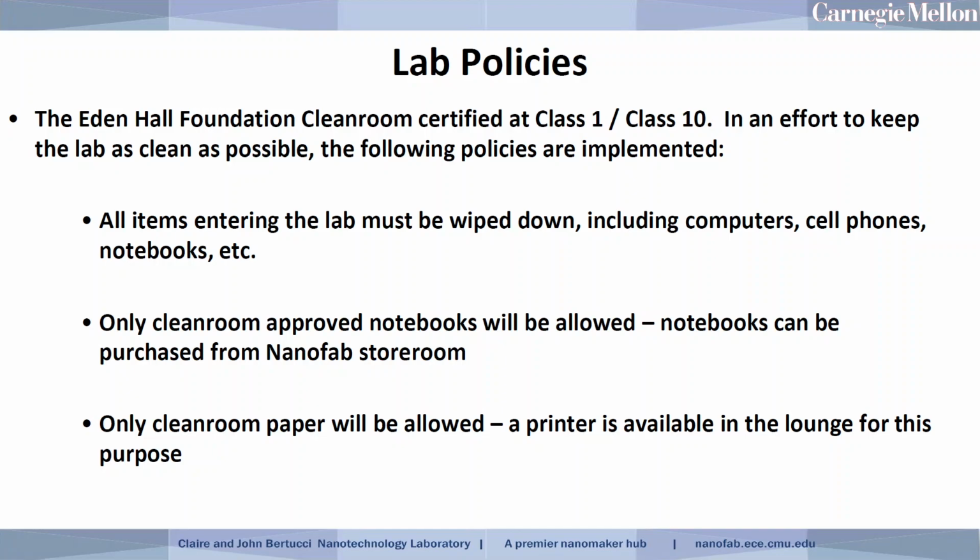So anything that gets brought into the lab is going to need to be wiped down, including any computers, cell phones, notebooks, sample cases, things like that. Everything will need to be wiped down with a solution that we stock at the entrances to the clean room. We don't allow regular paper in the clean room because regular paper gives off a lot of particles. So we only allow clean room approved notebooks, which is kind of a special kind of paper that is woven in latex based, and it doesn't give off as many particles.